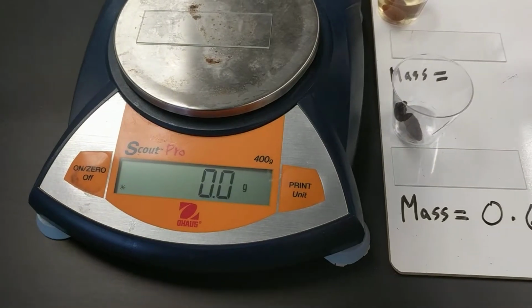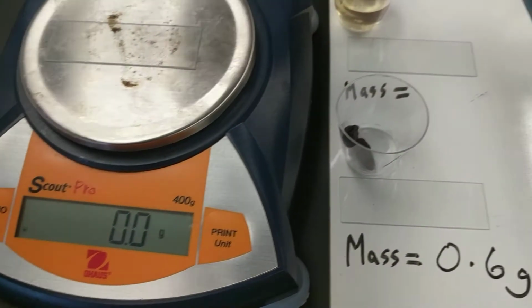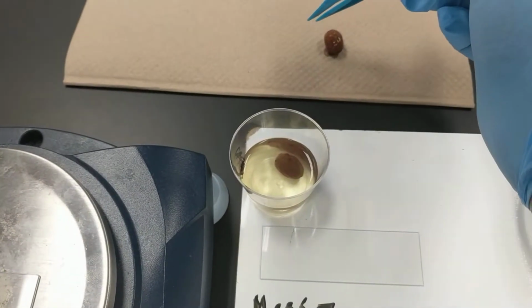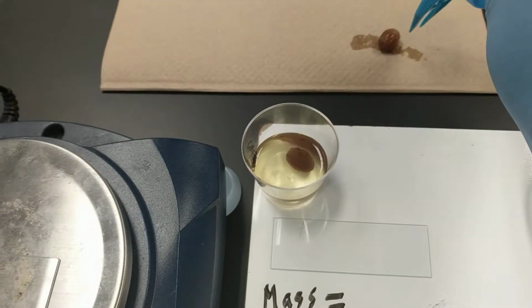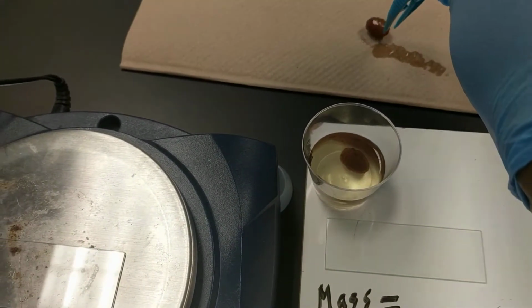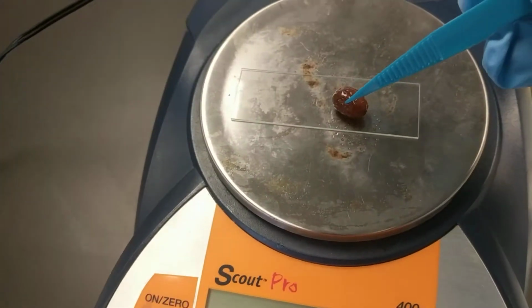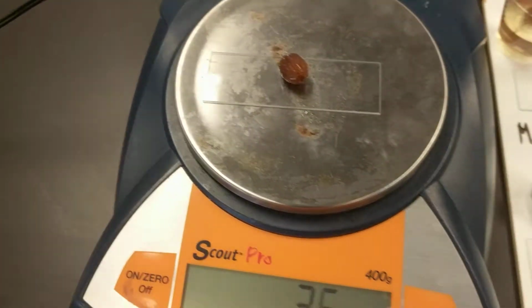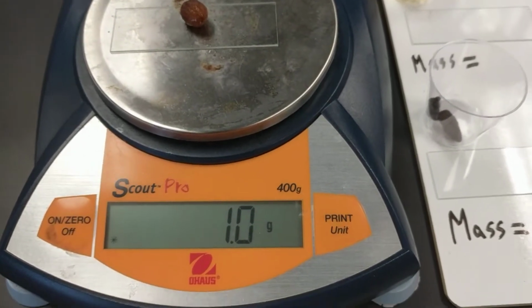And we want to determine the mass of the raisin that was placed in distilled water overnight. Want to remove the excess water, and place it on the scale. So the mass is 1 gram.